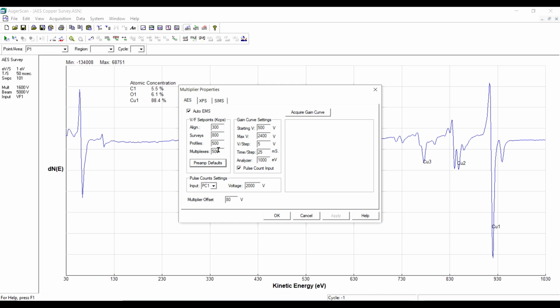But for the alignment, it's much, much lower, because the peak is high for an elastic peak. And therefore, after the peak, it drops down to 0. So in this case, it takes the counts before the peak, and so that's a lower number.